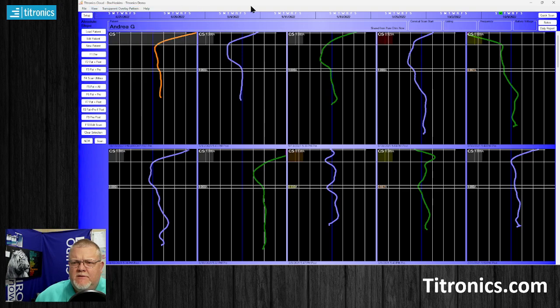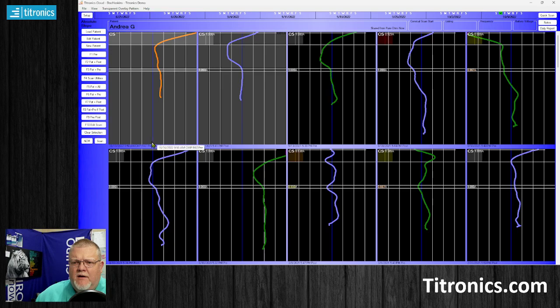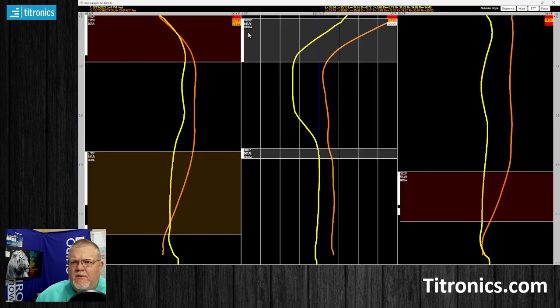I can't zoom in on this very easily, but let me just double click on this right now. So there it is. If I have this and the composite together and overlay selected, it gives me these numbers. I don't know if you can see these numbers or not, but for each section that we had defined before as pattern areas, it does 3 different analytics. There's an absolute slope, there's a relative slope, and then there's a Pearson coefficient.